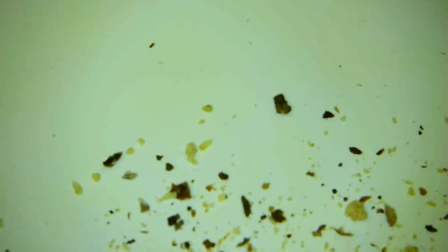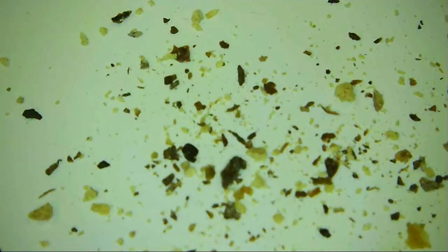What could this be? This is actually black pepper. Ground black pepper that you would have in a pepper shaker on an average table. I just shook that on the surface there, and you can see it's actually not all black. You can see the kind of white specks in there, and that's a still shot of that.